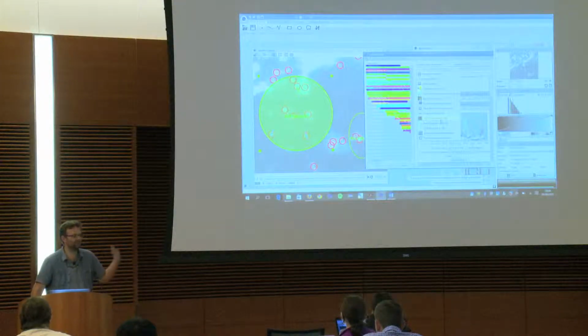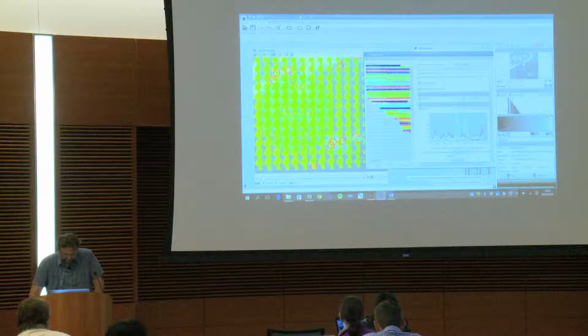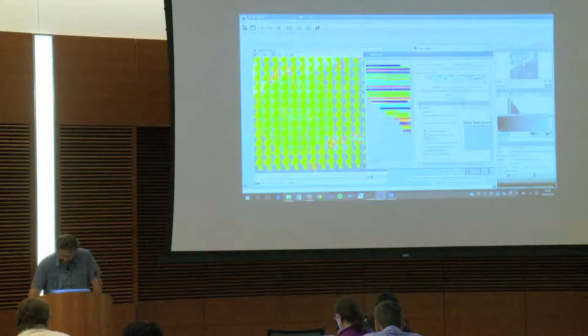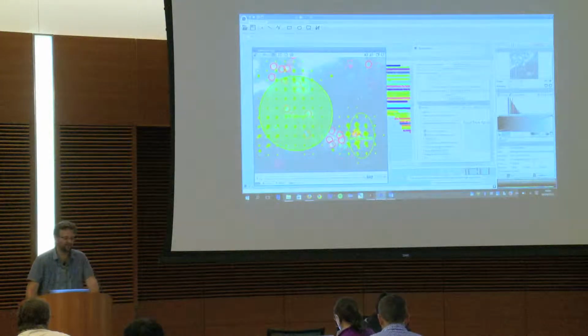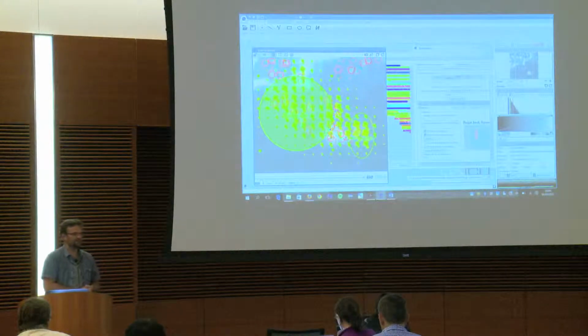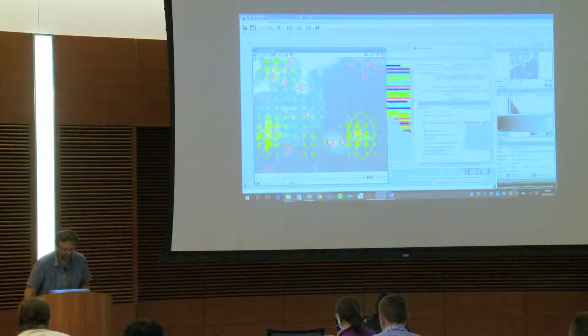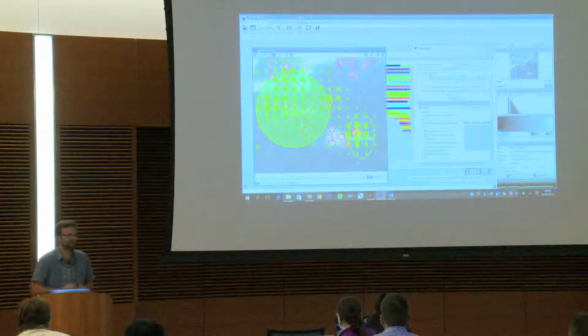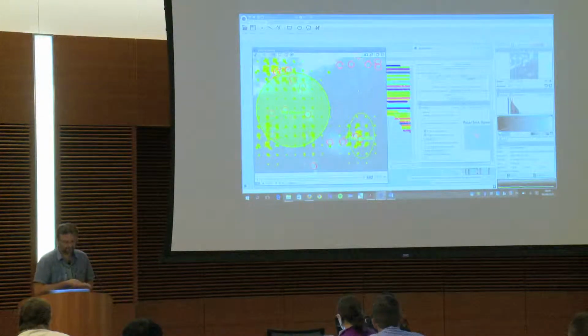And you can have another one, because when you see everything about the tracks, at some point you want to go back to a global view to understand the global scene. So to do this, you use track processor flow, and you put something more reasonable, and you can play it back again. And now you have a kind of forecast to see how your tracks are moving. And this is going to be also again interactive with this thing. And it's possible to put the graph on the sequence, whatever you want. Okay?